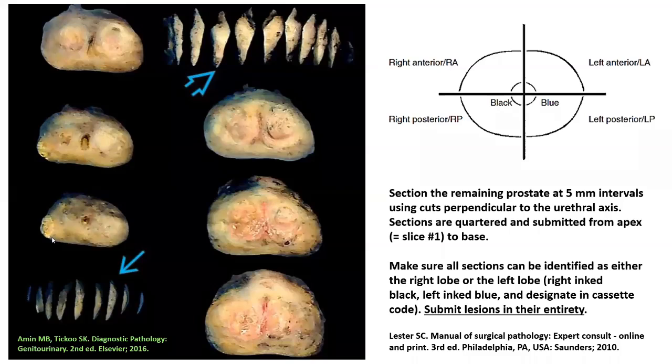And these areas are important because these are the grossly suspicious areas of the prostatic adenocarcinoma. One approach that I use is I usually go back to the prostatic biopsy specimens and look at the areas where the bulk of the prostatic carcinoma was actually reported out, and then try to correlate it to the level which I am seeing in the gross specimen.